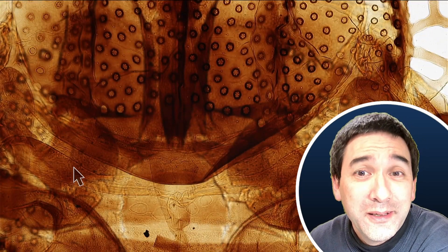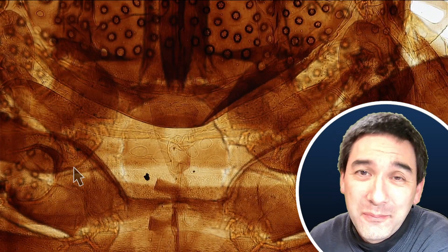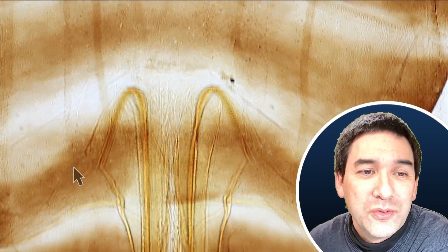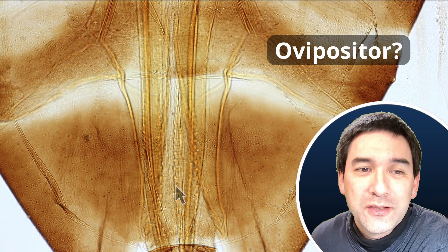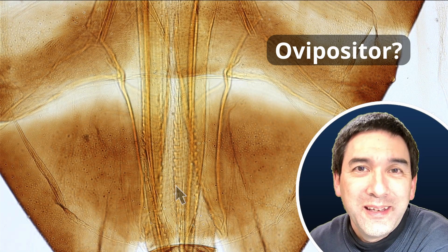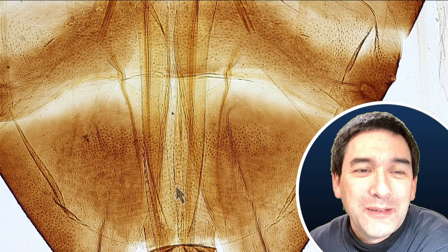Unfortunately it is nameless, but maybe not for very long — so maybe you're able to help out here as well. Here are the different segments of the insect, quite interesting to see. And here on the backside, this almost looks like a stinger. I don't know if it actually is, so maybe again you're able to shed a little bit of light on this.